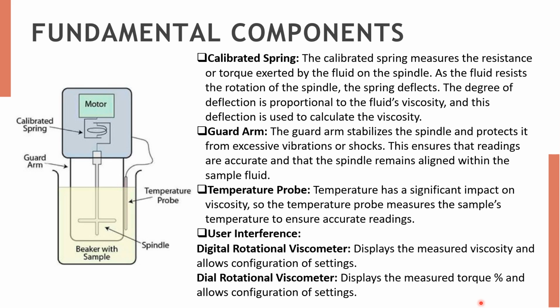So from these components we can understand how rotational viscometers in general work. First, we will take the sample in a beaker. Next, we will decide what spindle we have to use based on the literature we have. You have to go through the literature for deciding what spindle you have to use.